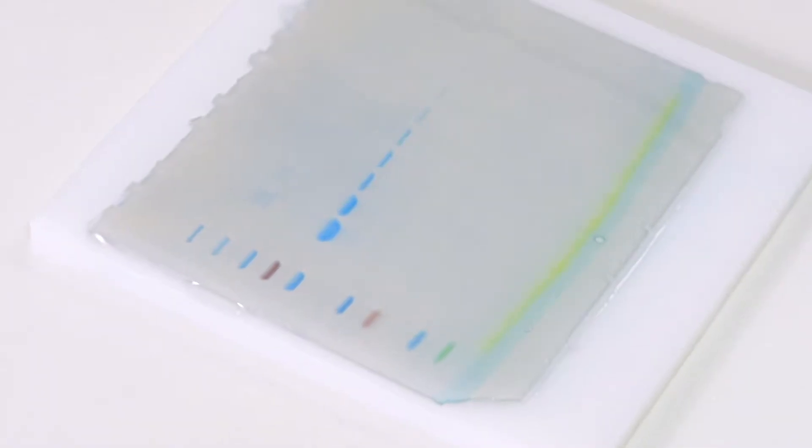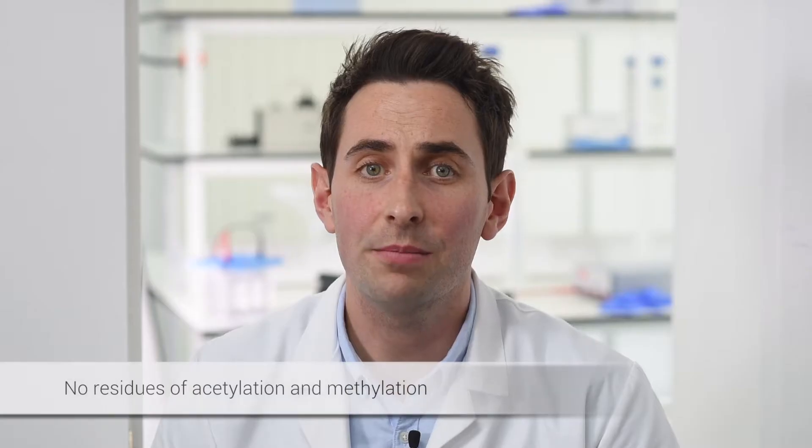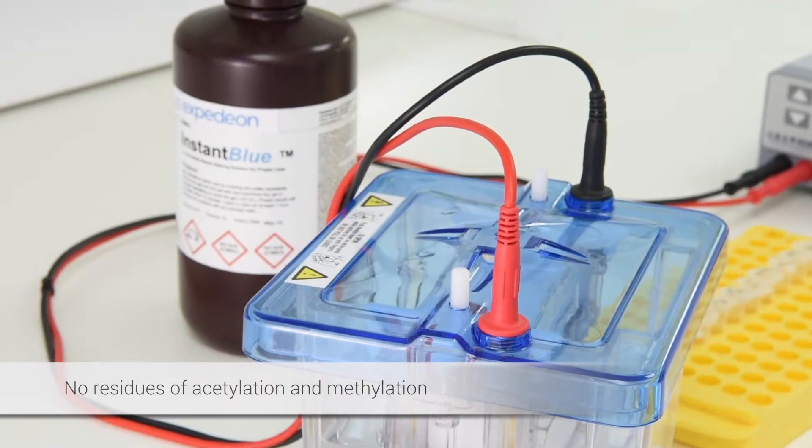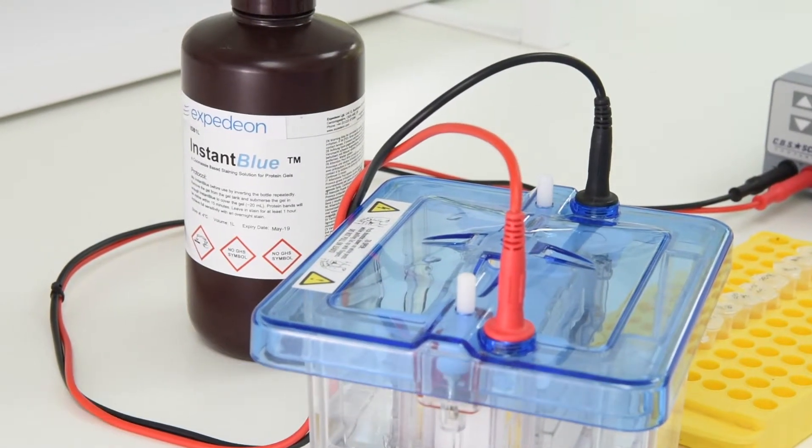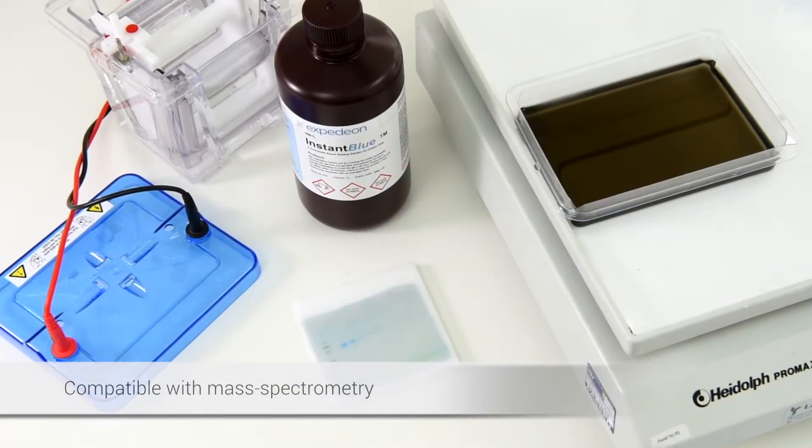Unlike other gel staining solutions available on the market, InstantBlue does not leave residues of acetylation and methylation, making it compatible with mass spectrometry.